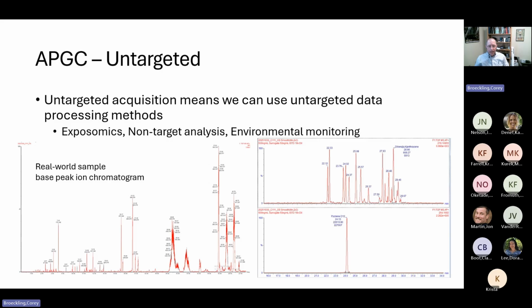So if we look at this top chromatogram here, this is an extracted ion chromatogram for the molecular ion for that dibenz[a,h]anthracene molecule that we showed before, a molecular weight of 278.109 as its radical cation. This peak right here, labeled as such, is the one that we're targeting for the assay. And we see about another 16 or 17 peaks here that all have the same mass, which our assay is not targeting, but we have strong evidence that there's a lot of isomers of this thing that we have the ability to detect and potentially further characterize. And this is just an example for the internal standard for that particular analyte at the bottom.